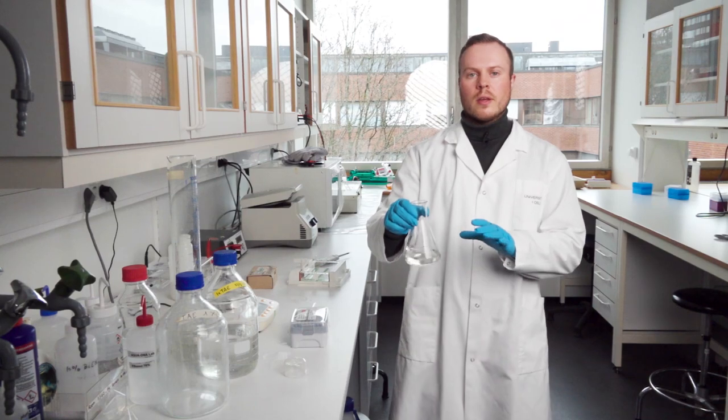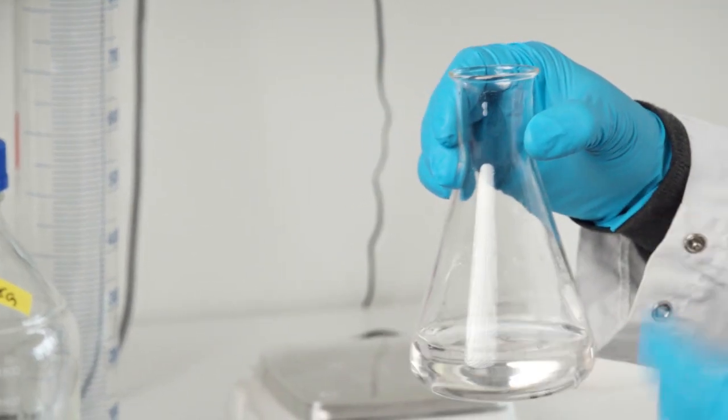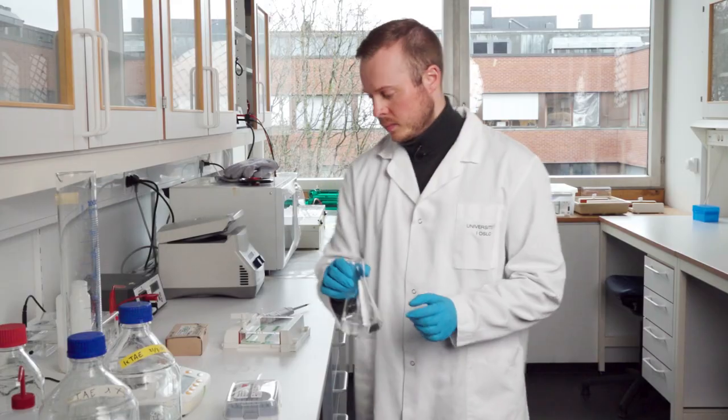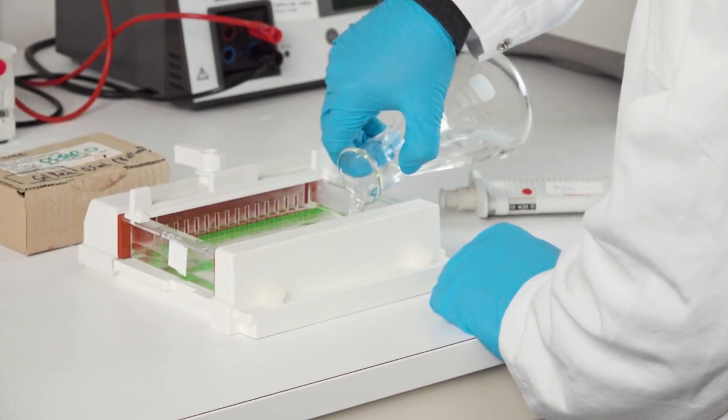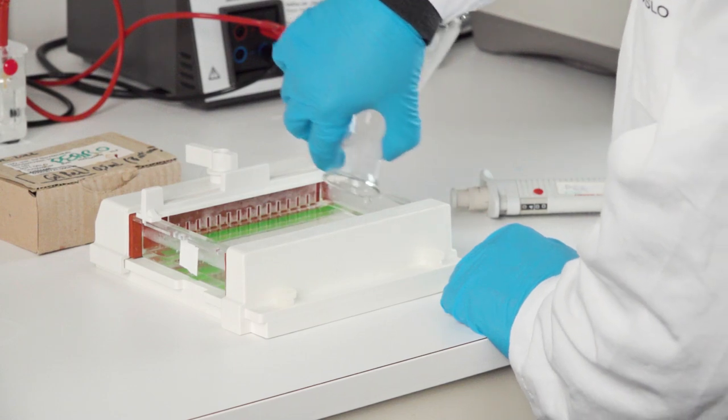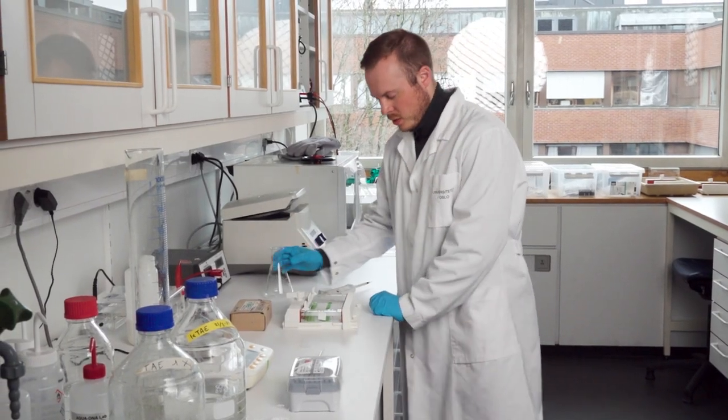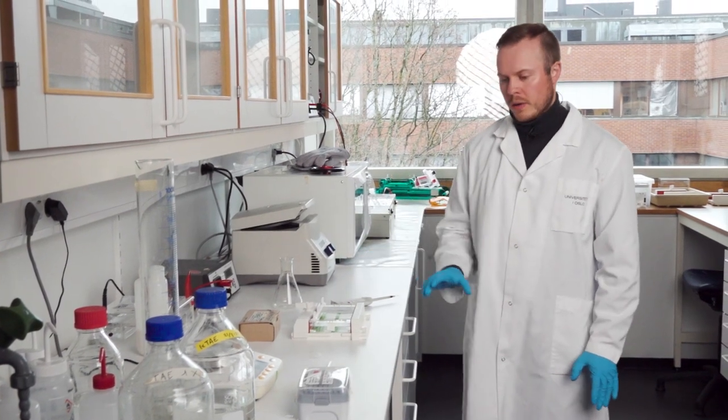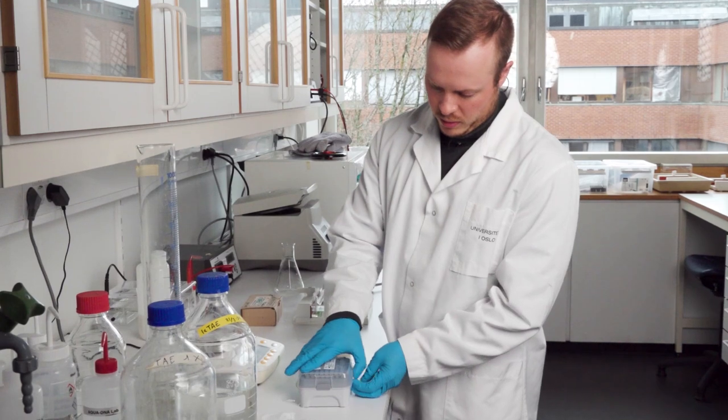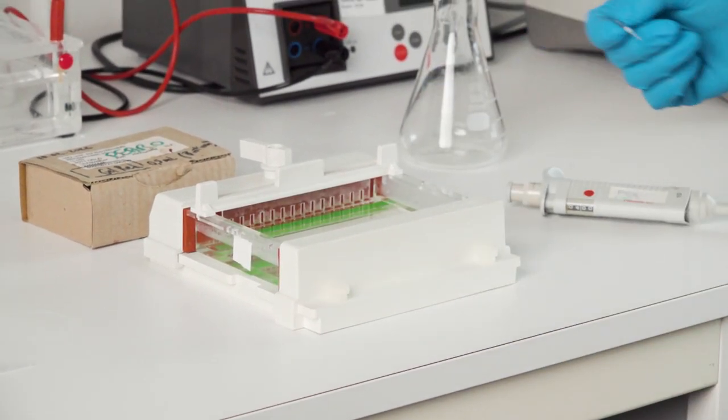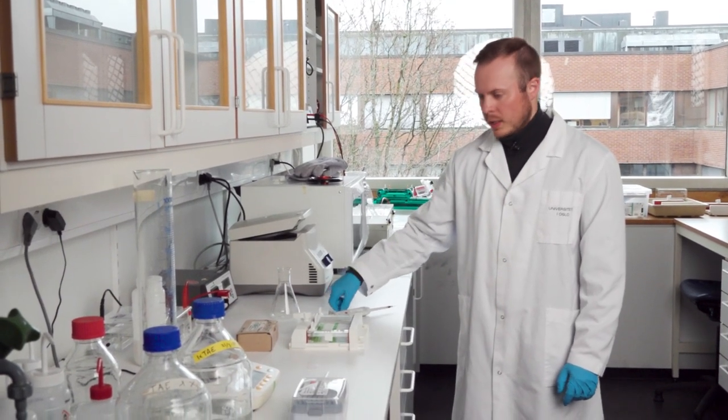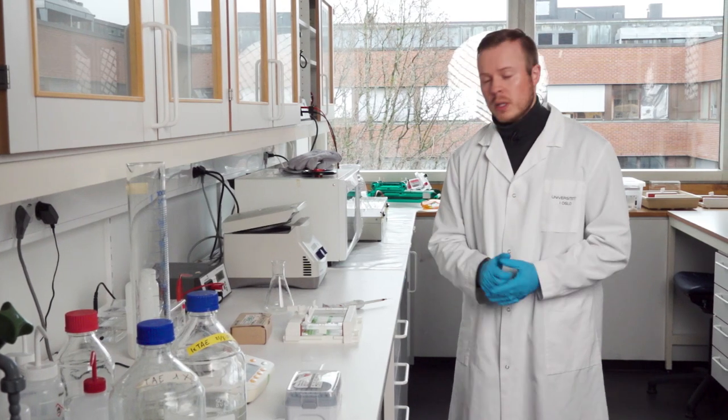We're ready for pouring the gel. Pour it quite slow and steadily. Sometimes you can get droplets inside here that can interfere. If you need to get those away, just take a pipette tip, move the droplets to one side, and take them up. Right now I didn't have any droplets, but that's how you do it. It needs to cool down for around 20 minutes to maybe half an hour before we can actually use the gel.